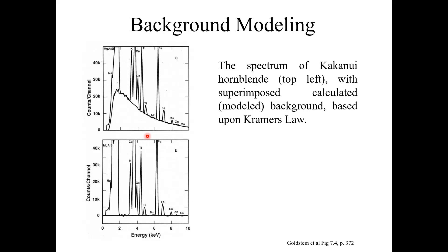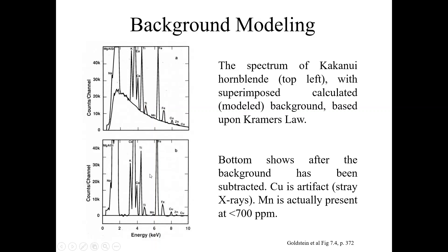Here again you can see two spectra. At the top is the spectrum of sphalerite with the superimposed calculated background based upon Kramers' law. At the bottom is the spectrum after the background has been subtracted. Copper is an artifact, and manganese is actually present at less than 700 ppm. After background modeling you can clearly see the exact difference between the two spectra.